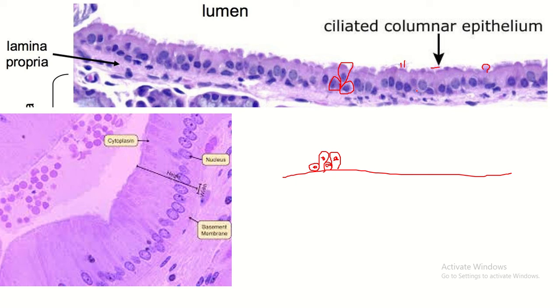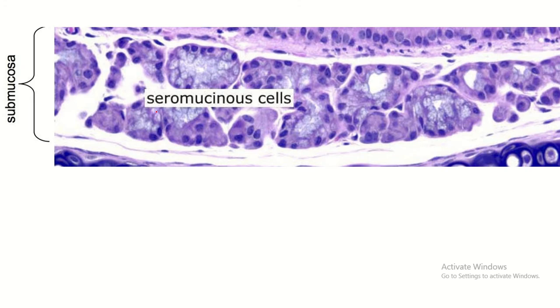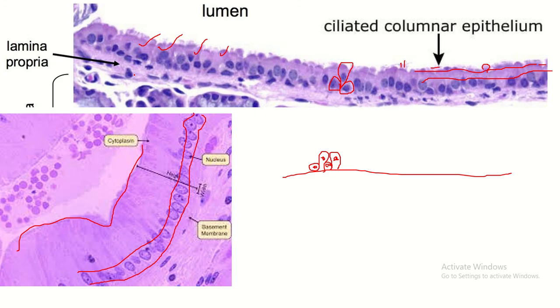One important point to identify this epithelium: the nuclei are at different levels, but a pink area is separated from the multi-layered nucleated area. A blue color line is created due to the presence of basal plate nuclei, and a pink cytoplasmic area is seen above the nucleated area — this is a very important identifying feature.